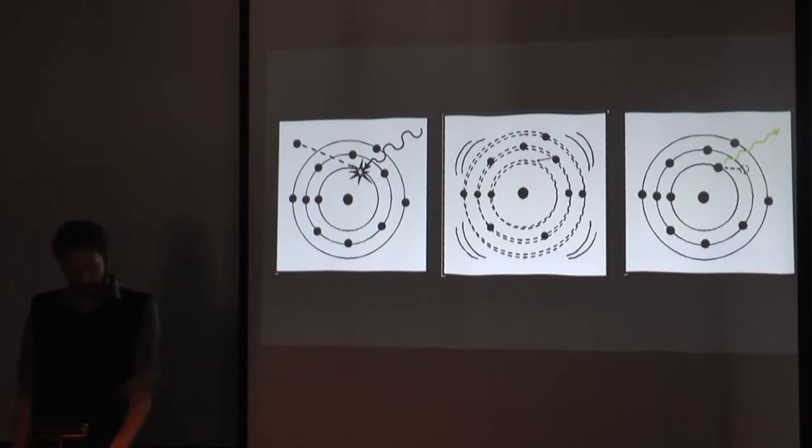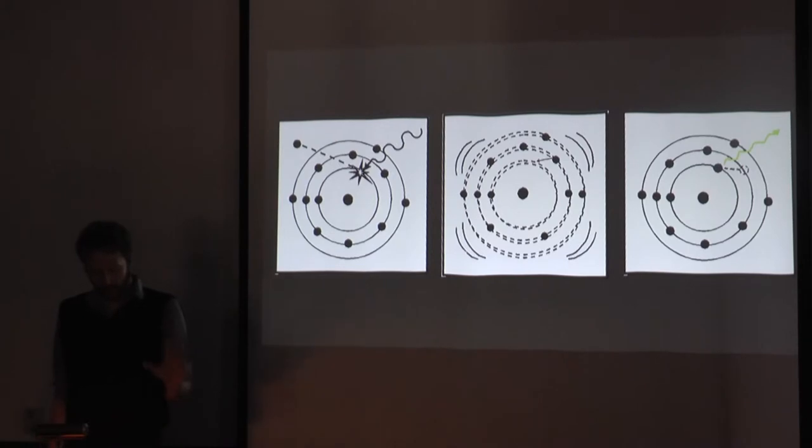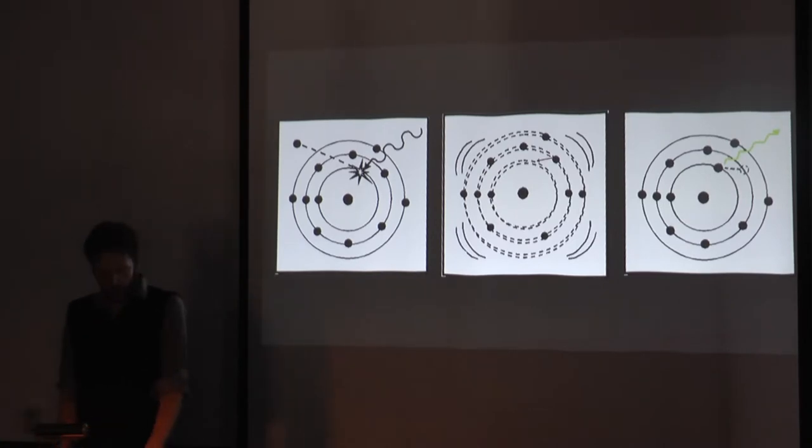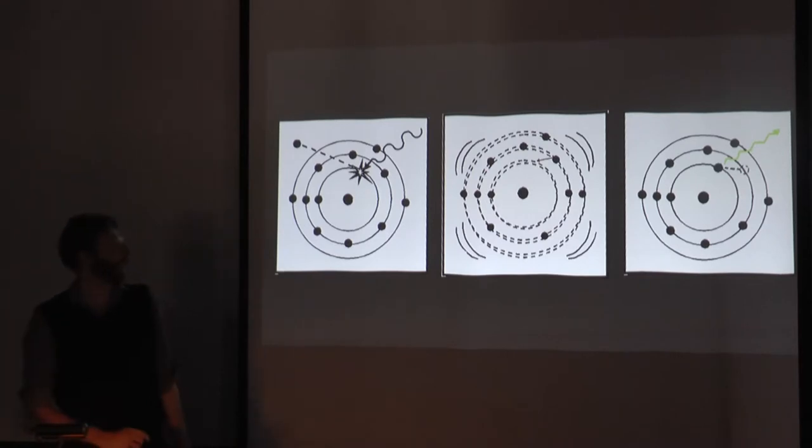When an electron is knocked out of its ring, the magnetic field within the atom gets all wonky, and an electron jumps from an outer layer down into the lower ring. Electrons in this lower ring require less energy than the outer electrons, and the excess energy is released during this process in the form of a photon, and the atom stabilizes, which you can see on this last image. The spectrometer then measures this released energy. So we're just measuring that little yellow line.